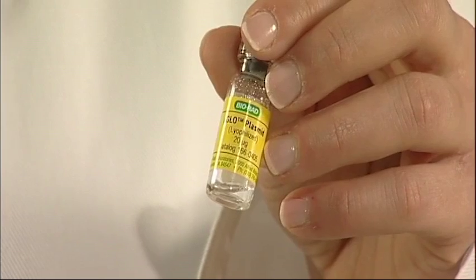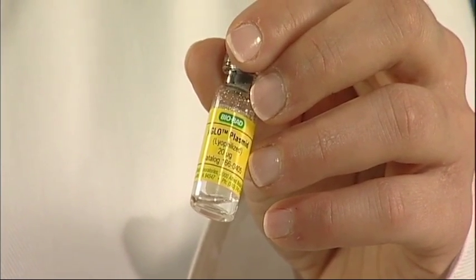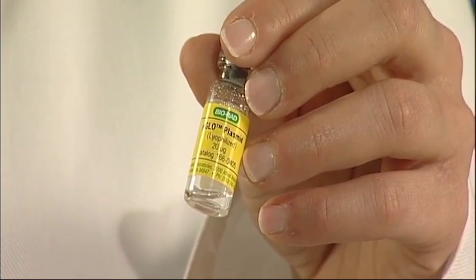Immediately prior to the lesson, you'll need to rehydrate the PGLO plasmid. Rehydrate this with 250 uL — that's a quarter of a ml — of transformation solution. This will be shared throughout the class.